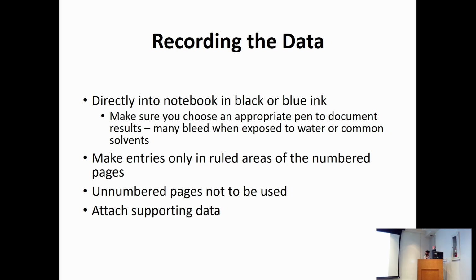Okay, then whenever you try to document things, it's better to use a pen. Why is pencil not good for this purpose, for documenting? Why is that? No, you can easily erase it, right?